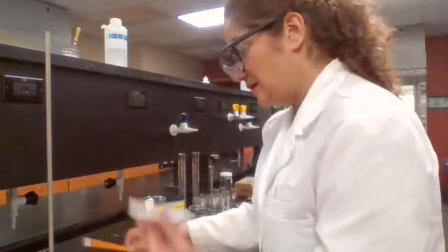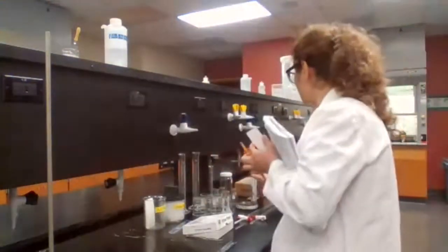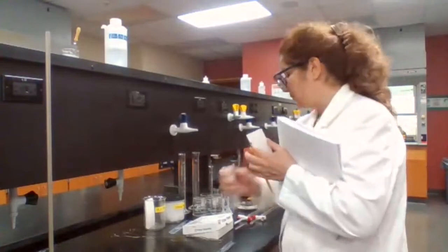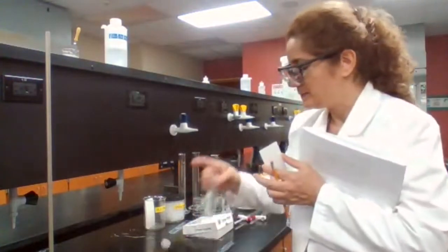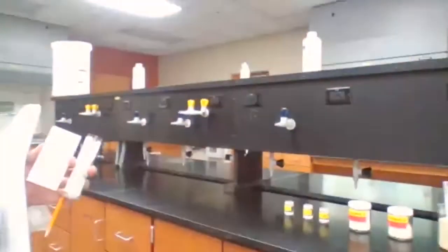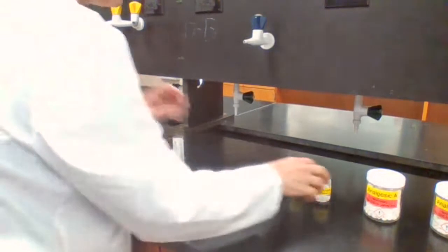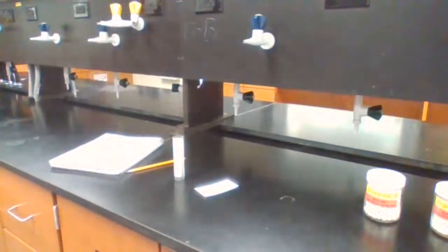So I'm going to spot the samples. Here is where I have my samples. I get the unknown also.